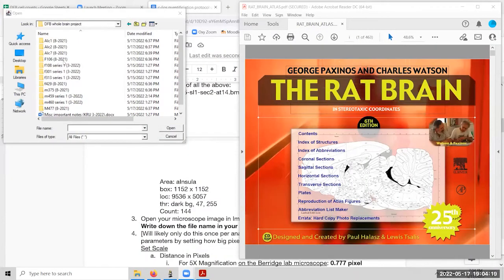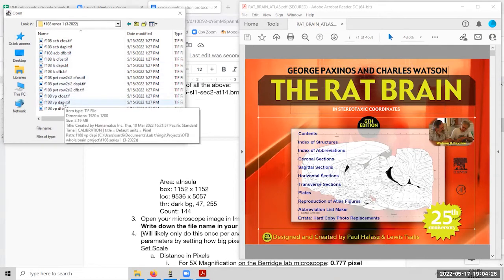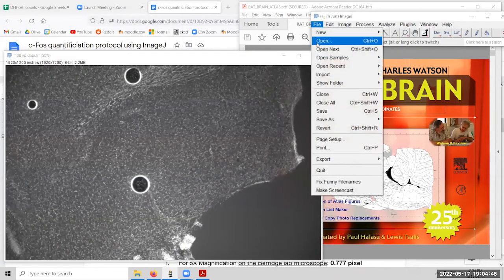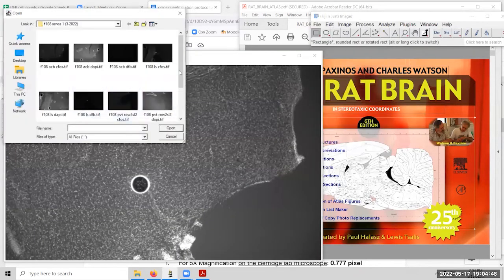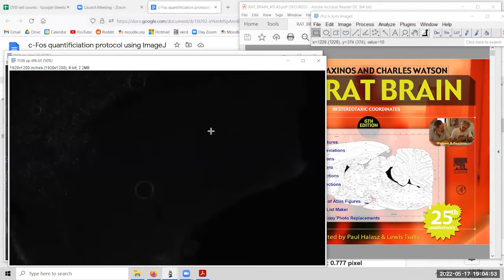All right, so the next order of business is another brain region. In this case, I've selected, in a different subject, the ventral pallidum. The ventral pallidum is interesting because in its more posterior parts, it can regulate pleasure, other sorts of positive affect type stuff, as well as disgust. So we're just going to go ahead and open up a few images from there. We got one open and then two. I use VP for short in this case.